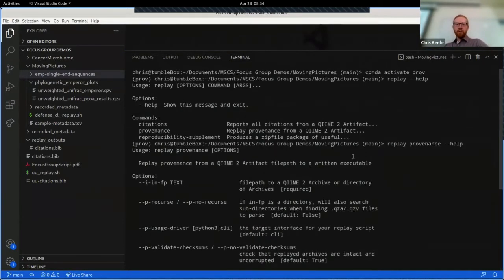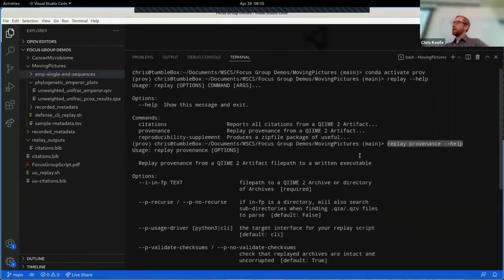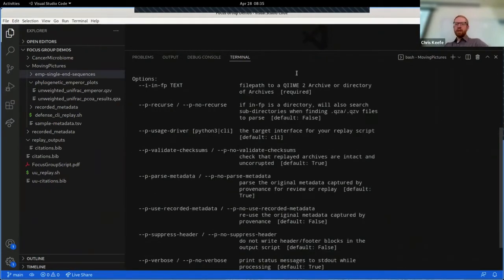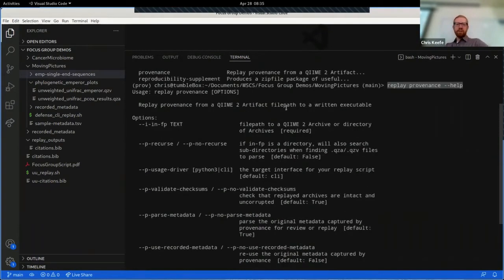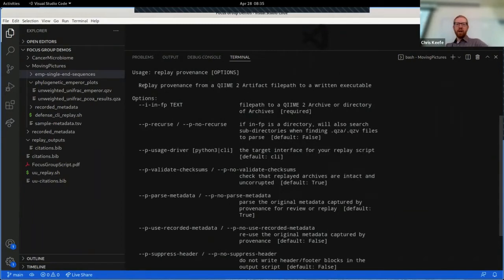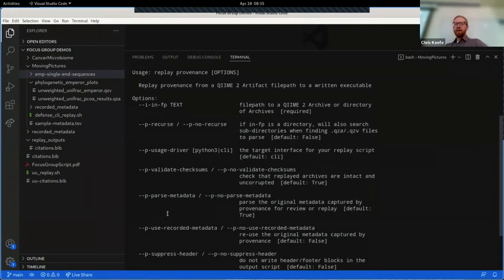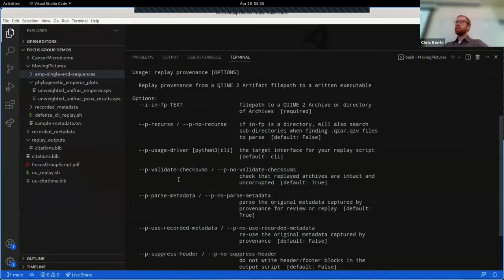You'll notice that just now I ran the command 'replay provenance help'. This is going to give us information on how this command works, what parameters are available and how we can use it. We can do all of this stuff through a Python interface too and hopefully in the future a graphical interface, but for now most QIIME 2 users are using a command line interface so that's what we'll demonstrate.